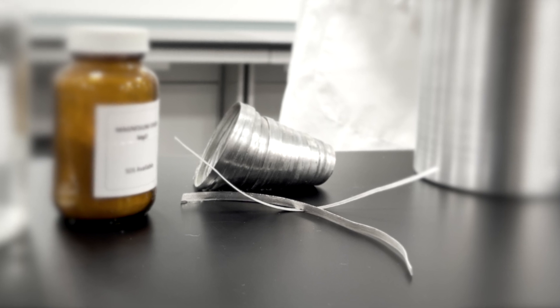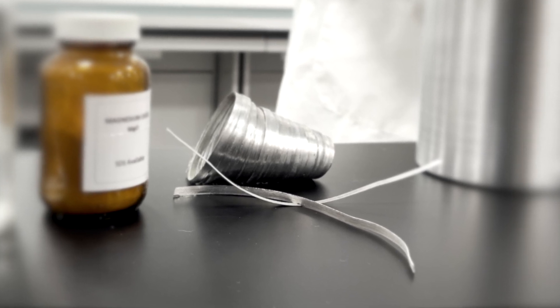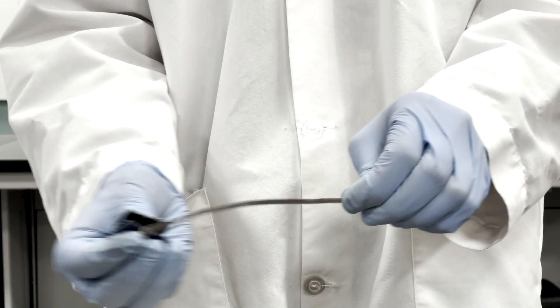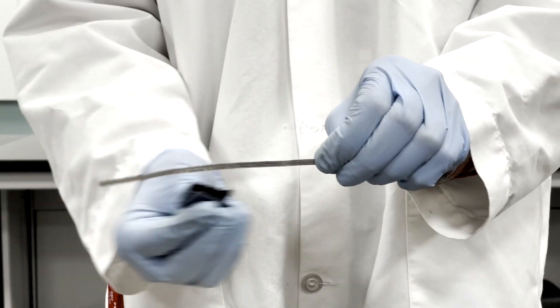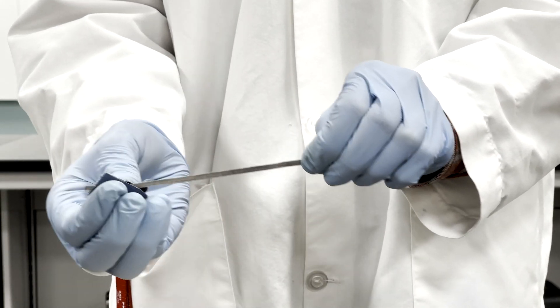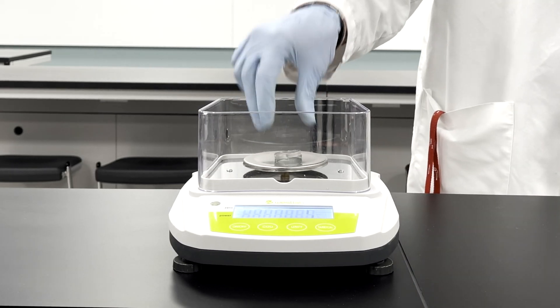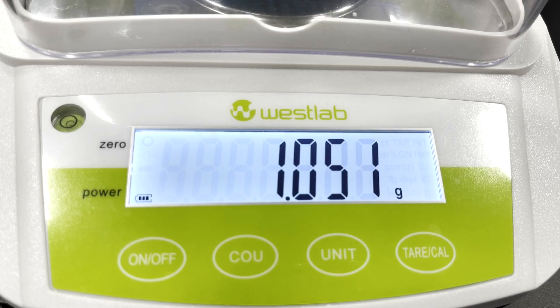Magnesium is so reactive that time in air causes the formation of magnesium oxide on its surface. We use the sandpaper to remove these oxides so that when we measure the mass of the ribbon, only the magnesium mass is recorded in the data table.